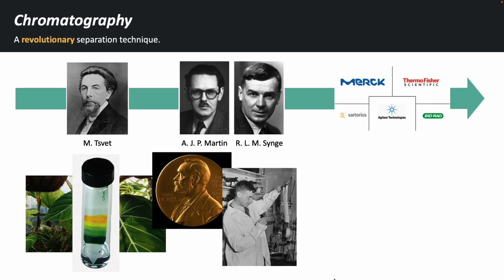If we move forward through the decade and on to today, we see the advent of incredibly high-powered techniques such as high-performance liquid chromatography, which was developed in the 1960s and 1970s and helped improve the speed, resolution, and sensitivity of liquid chromatography. And then we also see a variety of more sophisticated detectors, columns, and stationary phases.